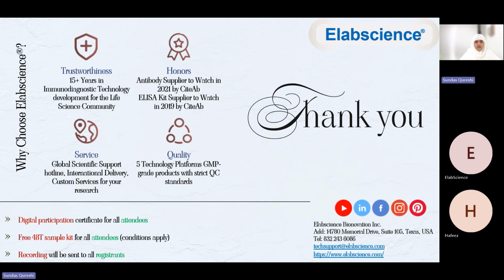Now we have another question here. When designing a study, at which point are TOS and TAS measurements most informative?